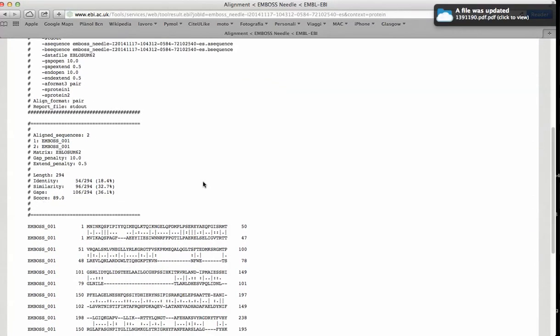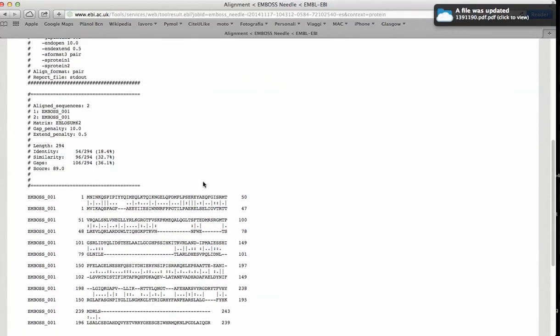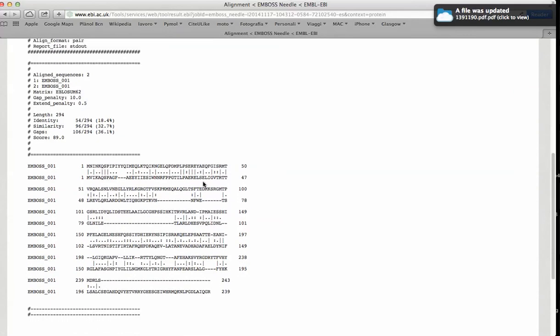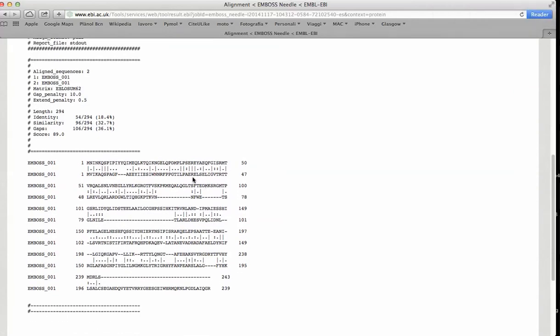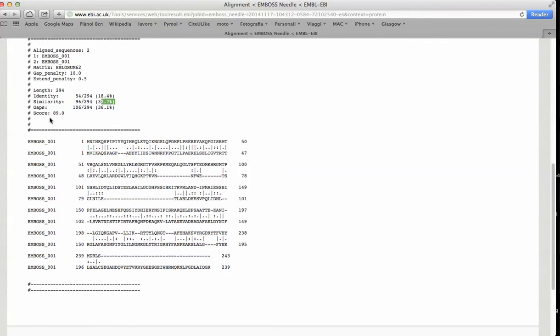And here we have the results. A very low value of identity and similarity, very low value of scores and a lot of gaps in the two sequences.